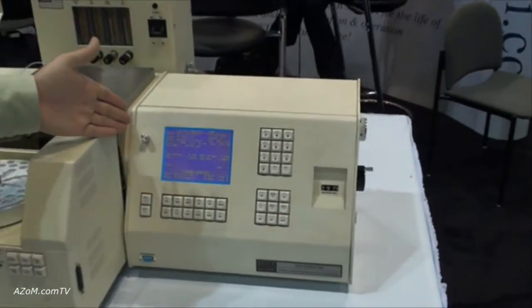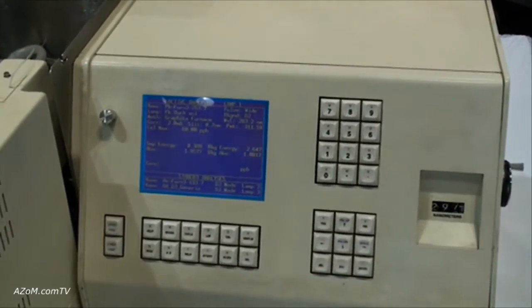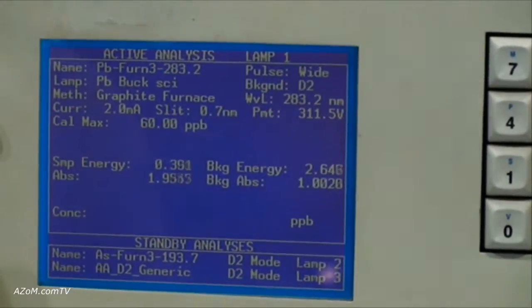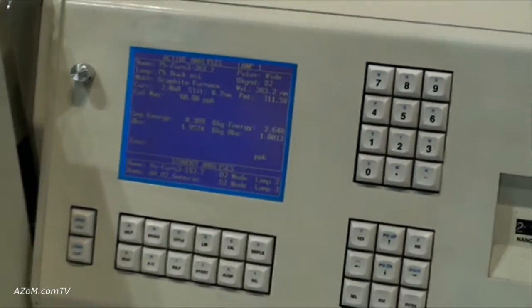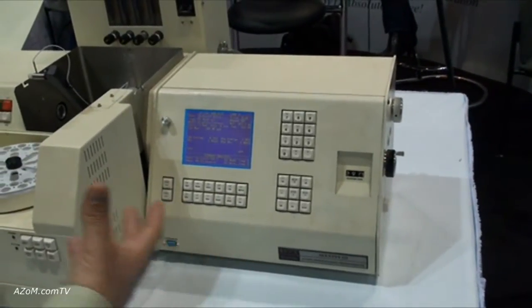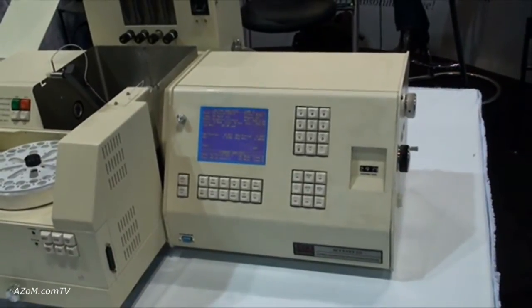We have our firmware over here with all of the libraries loaded for normal analysis using the graphite furnace or the flame. Controls are all manual, so as you're setting the monochromator it's excellent for academic use, allowing students to really understand what's happening with the analysis.